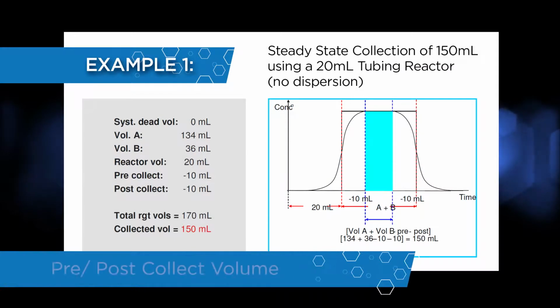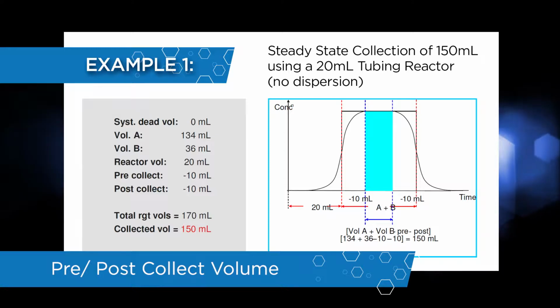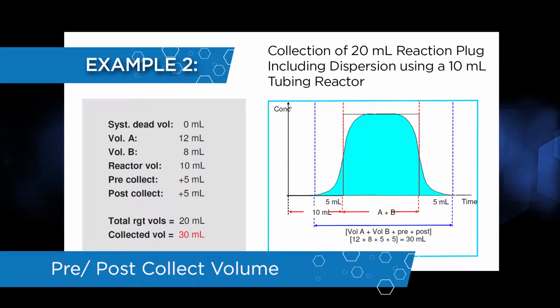One of the major attributes of this is a pre- and post-collect volume. That pre and post collect volume allows the machine to collect either before the dispersion plug goes through, or either the heart cut of the dispersion plug or the entire plug. You would collect the entire plug if this reagent or materials are very expensive. You would collect only the heart cut if you wanted to see what the maximum concentration is. So these are attributes that you'd be able to set.